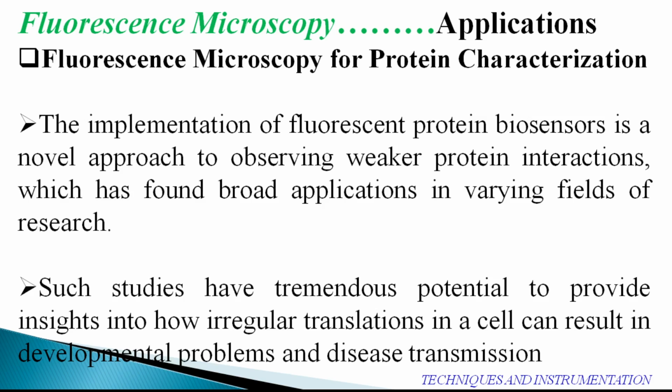But they also require exceptionally highly sensitive instrumentation, and of course highly tunable chromatic filters, to carry out very accurate assessment data. So that is only one limitation, but even then we can carry out such protein characterization in an excellent fashion.